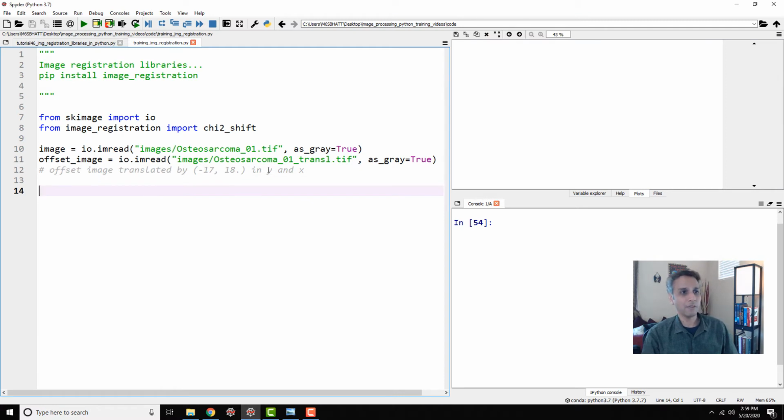As usual, I have a few lines of code. For this, like I said, I intentionally misaligned some images, so that's what I'm going to use here. First, I'm going to show only one image for these 3, because I'm doing this for informational purposes only. But then for PyStackReg, let's actually get a bit deeper in the next tutorial.